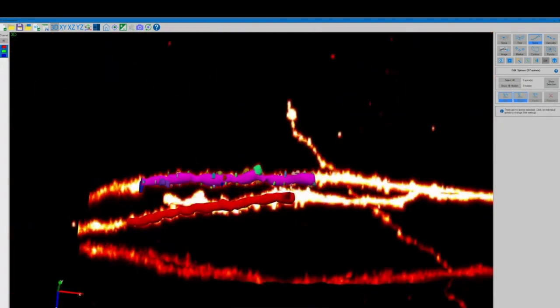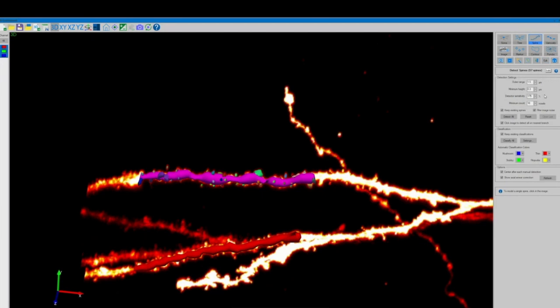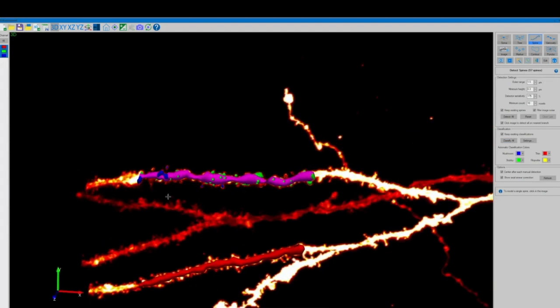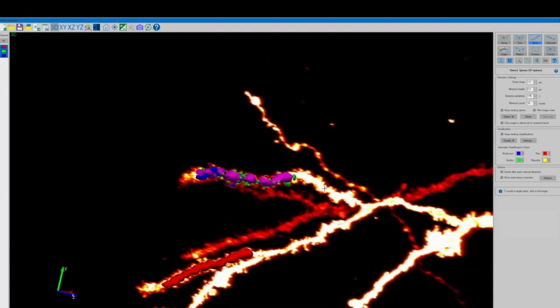Once we're satisfied with the visual checks of our spines we can click the classify all button to automatically classify all the spines into mushroom, phillipodia, thin, and stubby subtypes.